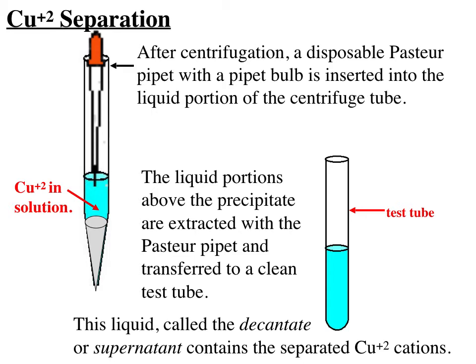But it's also possible that if there's a very low concentration of it, just like in our colorimetry experiments, there's not enough orange light being absorbed by this sample, and we would have a hard time seeing with the naked eye the blue color that would qualitatively tell us that copper +2 is present. So what we're going to do is add another material which will complex a little more intensely with copper +2 than water is complexing with it, and it will give us a more intense color reading.